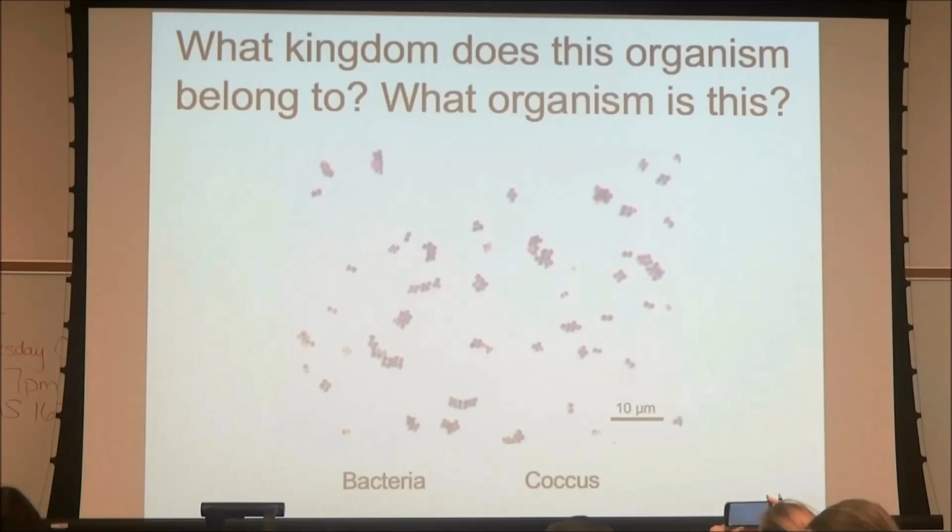How did you know it was the bacteria, not the fungus? There's no nucleus. Very good. So you know it's the bacteria and not the circular fungi because there is no nucleus.